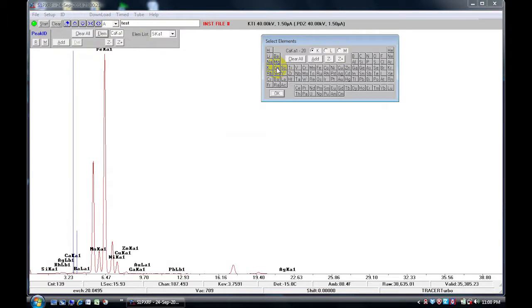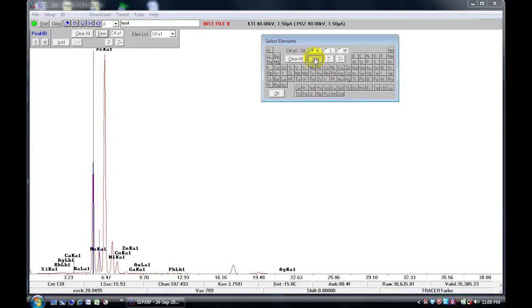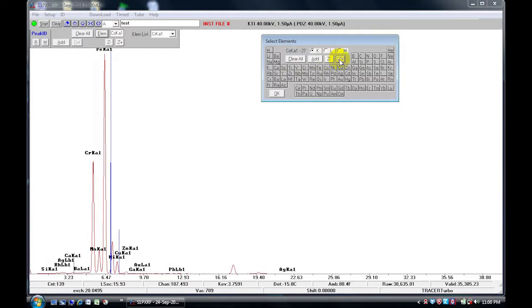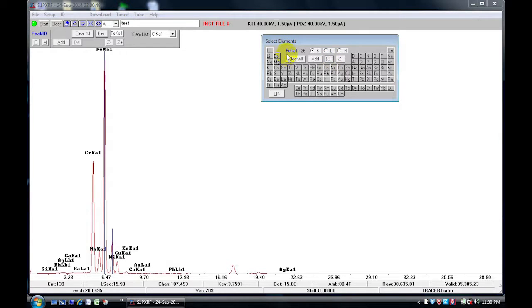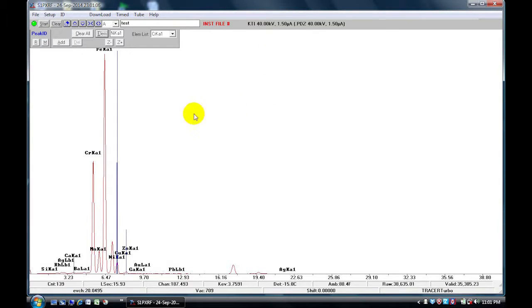And you can pick and go across the periodic table. If you are interested in that peak, you can add and it will be labeled on your spectrum. You can also go to Z-plus and Z-minus, and that will continue going up and down the periodic table. This tells you also where you are at in the periodic table when you are moving across to the different peaks. So once you are satisfied with your peak identification, you can also save that file.